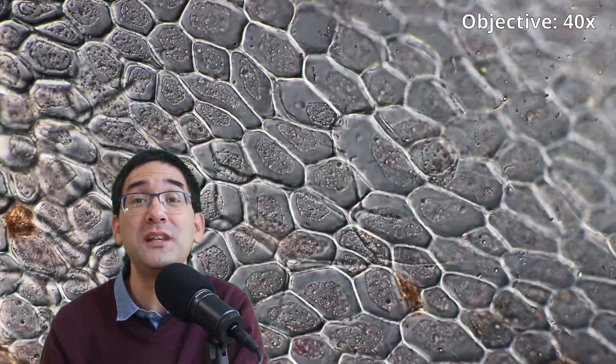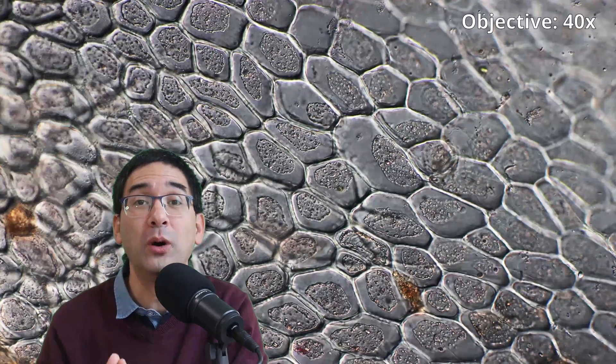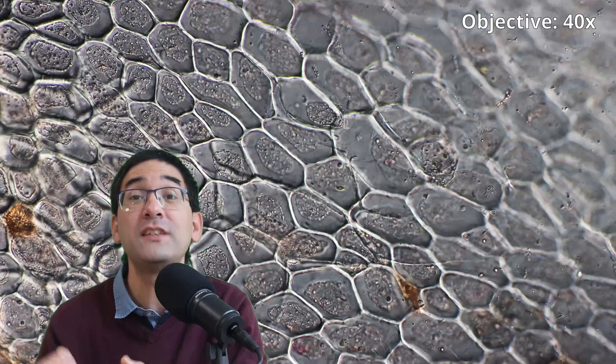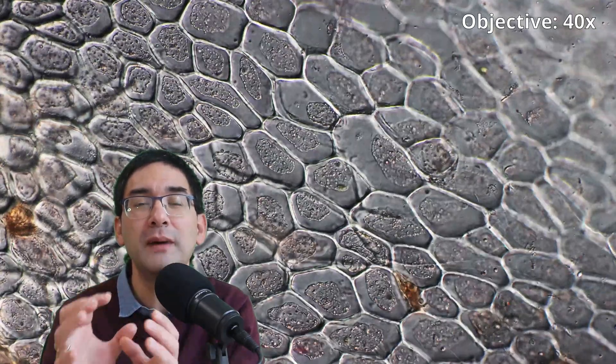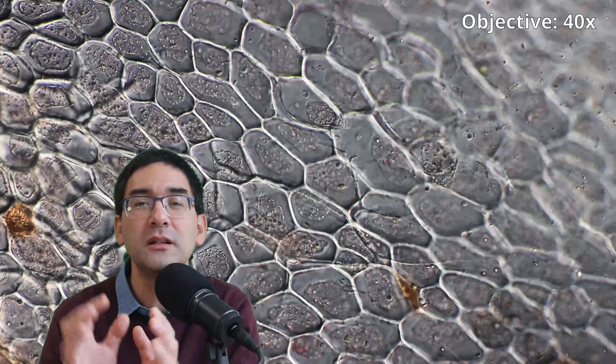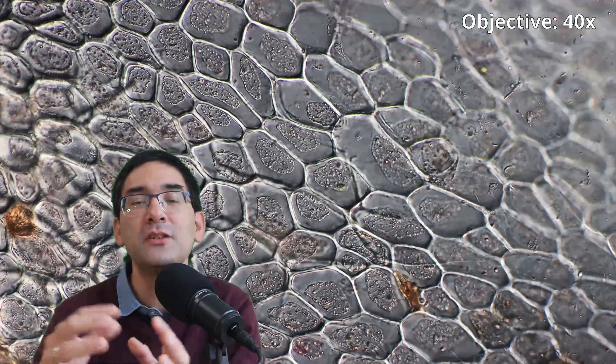Yes, let's talk a little bit about what we see here. What we see is primarily the cell wall. Cell wall of plant cells is fairly thick. You have to look very carefully into each one of those cells to see that there might be a little bit something that looks a little bit like a cytoplasm.